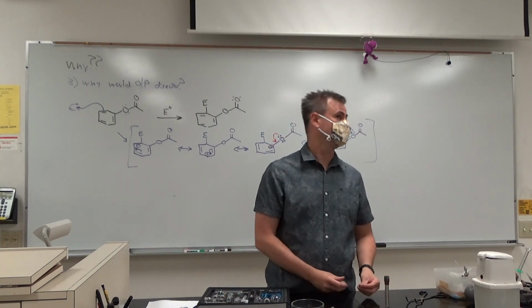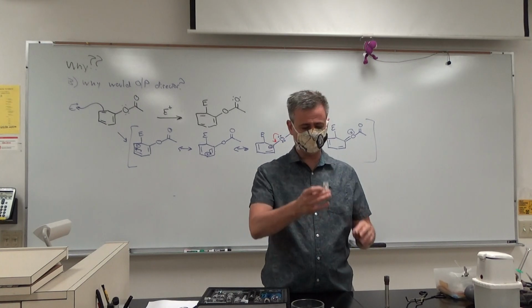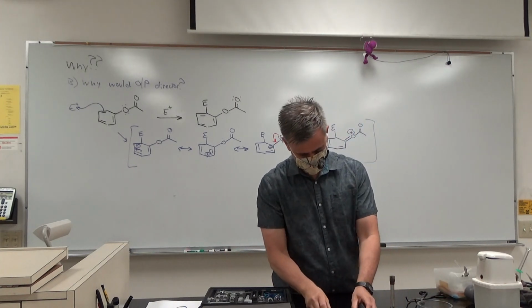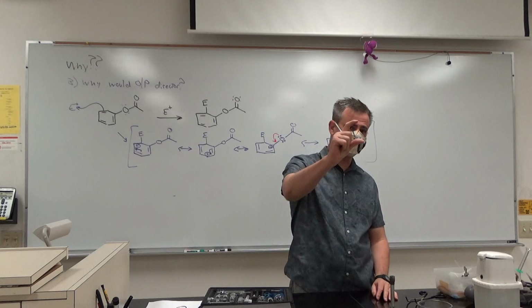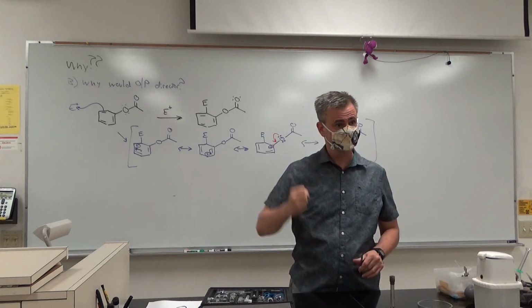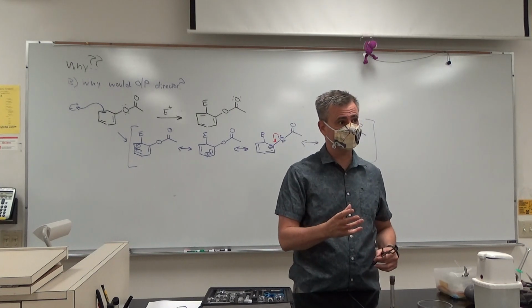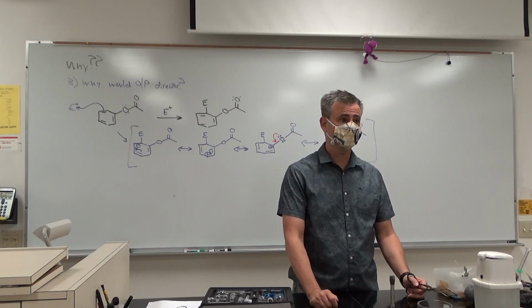I guess, yeah, we are just flame drying 4 things, okay? Put the stir flea inside the conical vial. As always, Bunsen burner, bowl on one side, unflame dried stuff on the other side. The 4th thing is one of those real small little test tubes. You guys all know how to flame dry. Hair needs to go back, all that good stuff. And then look for the fogging and everything like that. As soon as the fogging's done, you put it in the bowl, and so forth.